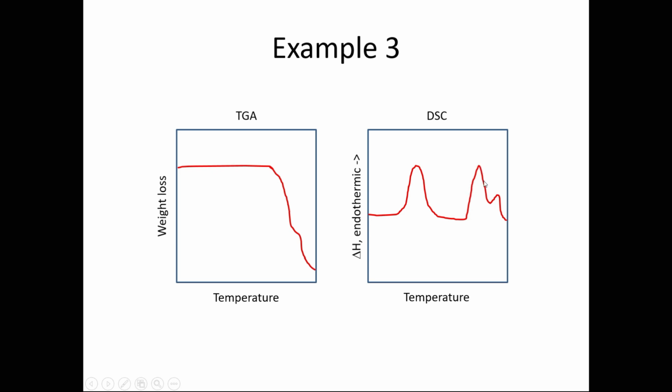Then a subsequent peak is another endothermic peak here and an endothermic shoulder here. In fact, the presence of these indicates that these are two different events, and the TGA confirms that there are at least two different events happening. So degradation stage 1, this part, and stage 2 here, so it's not really well defined on TGA. That's why it's not a separate peak on DSC, but a shoulder of this peak.